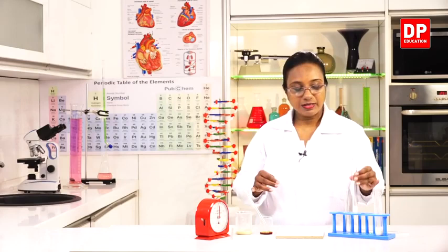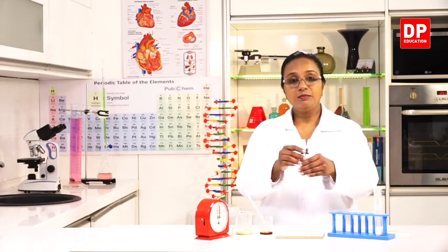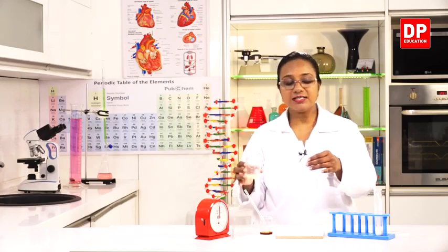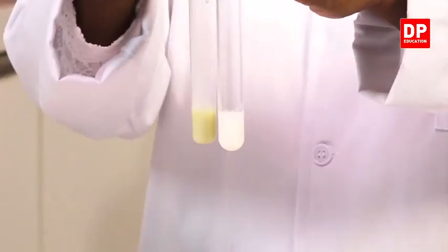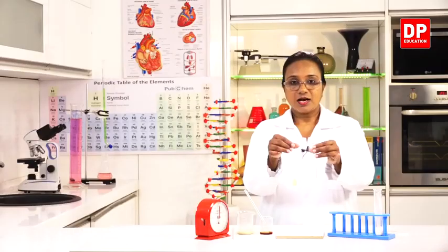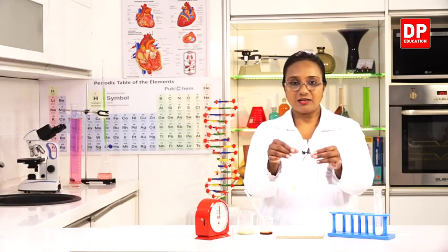To this, we will be adding 2 milliliters of the germinating green gram extract, which contains amylase. So, now I have equal volumes of starch solution and the amylase extract.